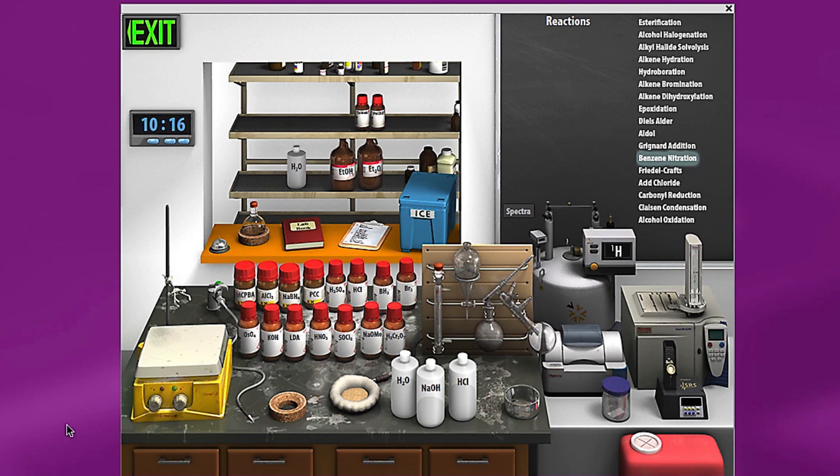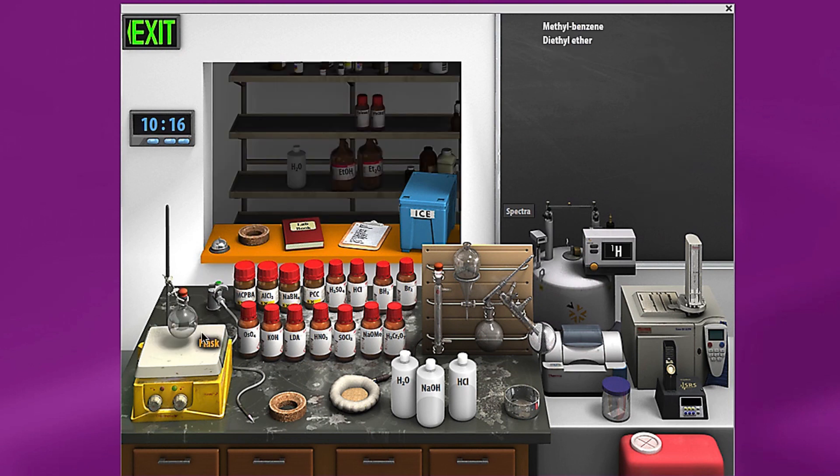So in this experiment, the worksheet asks you to make 1-methyl-2-nitrobenzene. In order to do that, I'll need to take methylbenzene as one of my reactants and place it in my flask. I can add ether as solvent, bring my flask out here to the stir plate. The reagent I need to add is nitric acid.